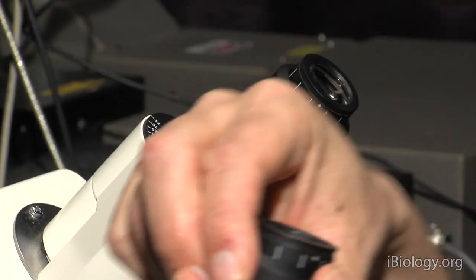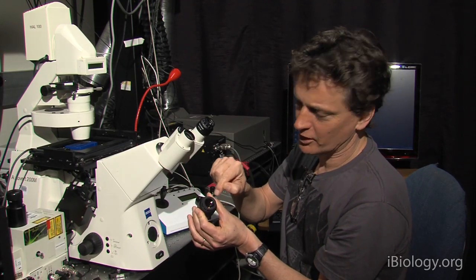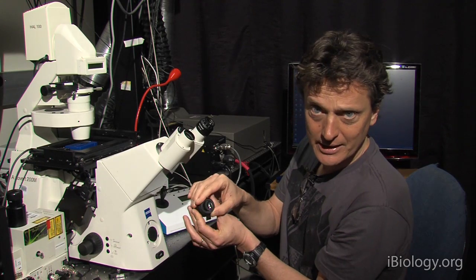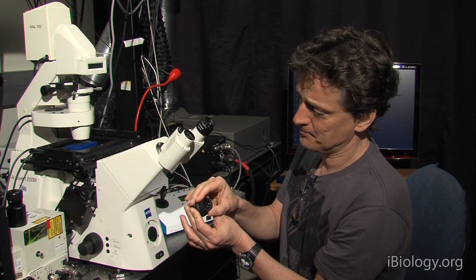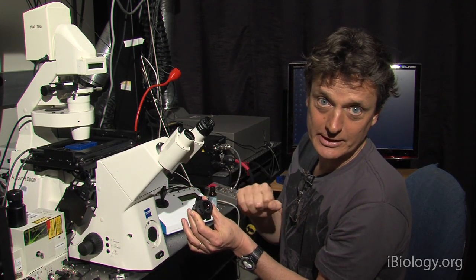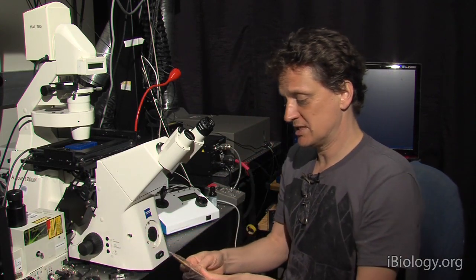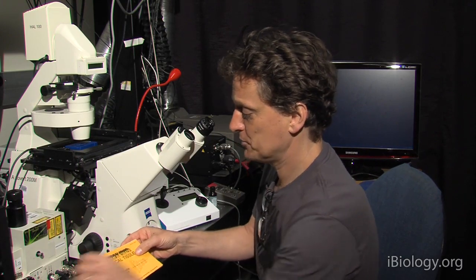First of all, what often happens is that dirt accumulates on the eyepiece. These are pretty clean in this case, but dirt will definitely make it harder to see things. So what you want to do is to clean them using an optical tissue.